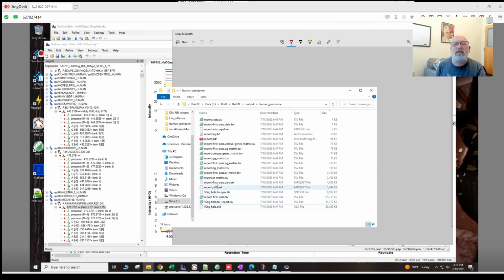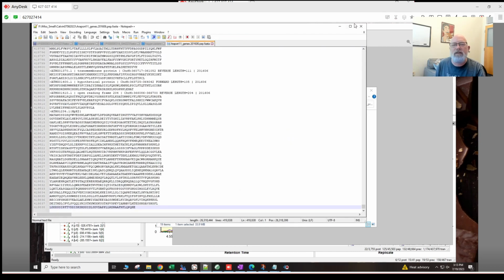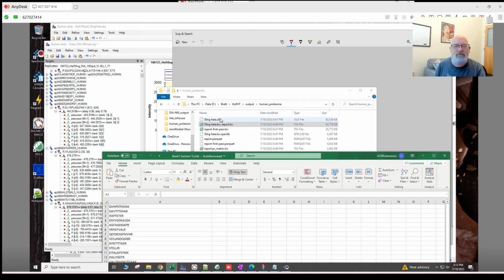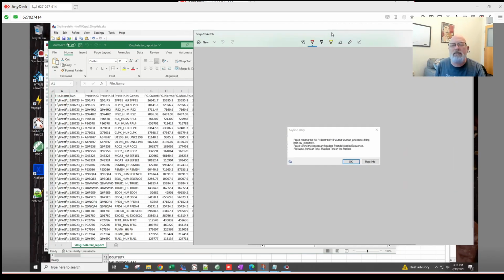Okay, let's see, program output, report. This was the one we renamed. Oh crap, I don't want to open it. I want to open it in Excel. Let's see, we'll just open it in Excel. I'll drag it in there. Okay, and then what did it want again?